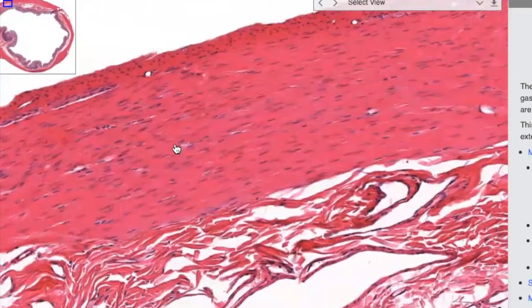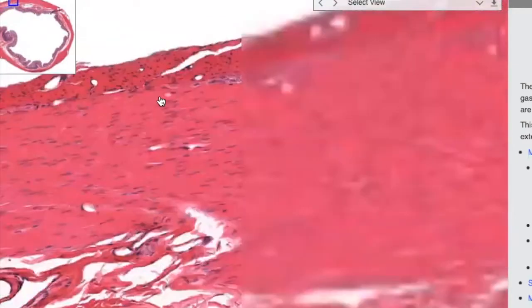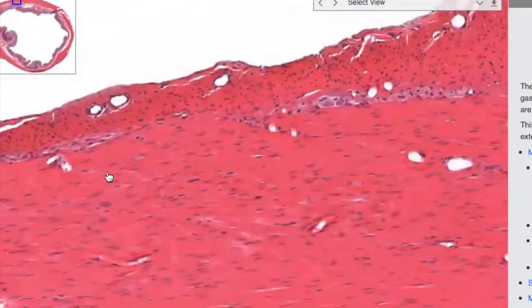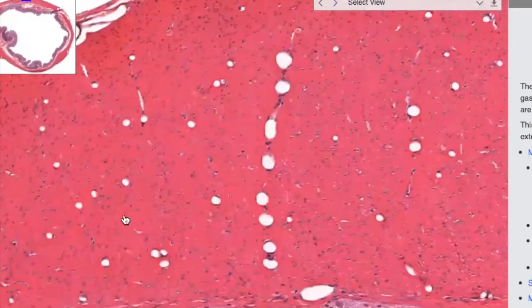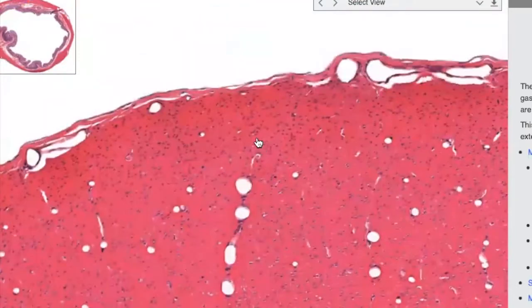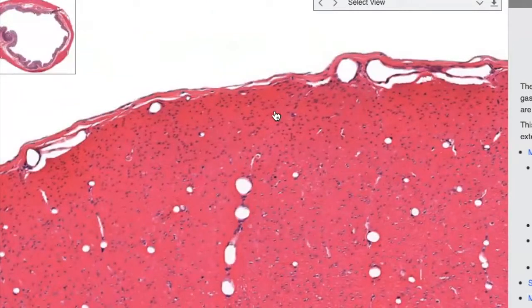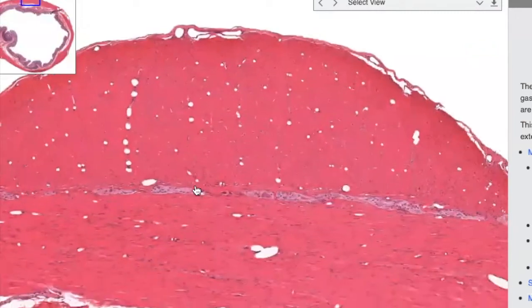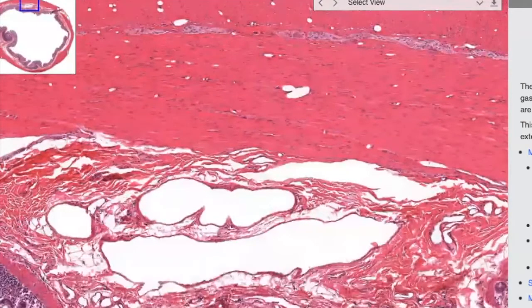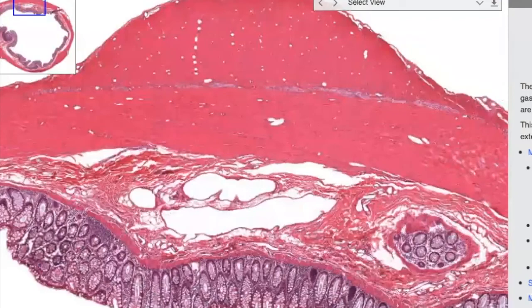The inner layer will be thicker for the most part, with the exception of these big enlargements of the external. These are what's going to create the haustrum that you see. If you look at the intestinal models, the large ones, you'll see the haustrum. They're the thin strips that you can see externally. That's actually the longitudinal layer over here. Okay, on the outside. So that's the cross section of the last region of your colon.